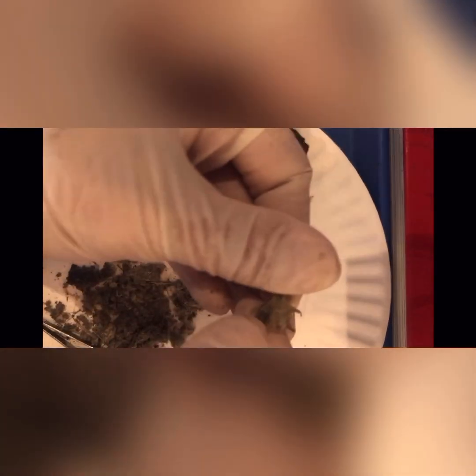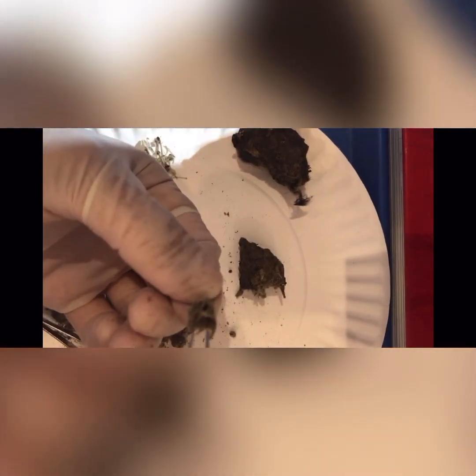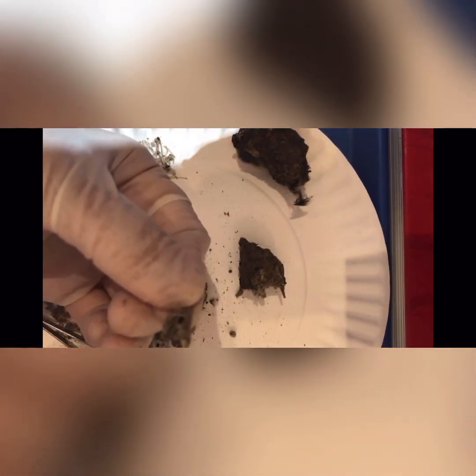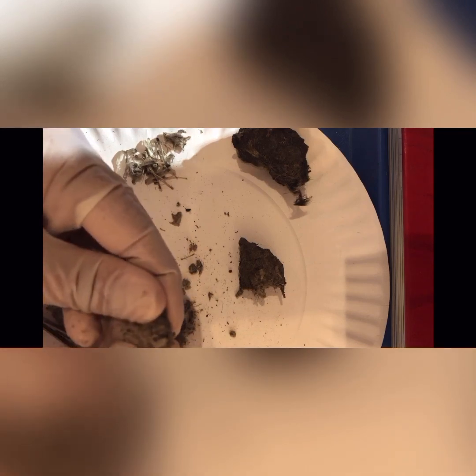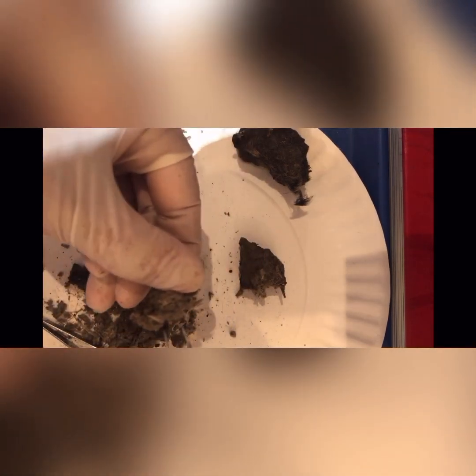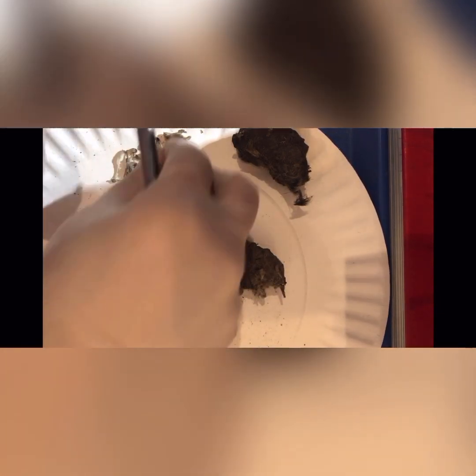There we go. And I have a part of the skull. It's another exciting part that I found. So this is another big piece to my puzzle. And I'm gonna look at my key a little later to see what animal I think I have. Another big bone. That's gonna be really, really helpful. Ooh, wow. Treasure chest of bones. So exciting.